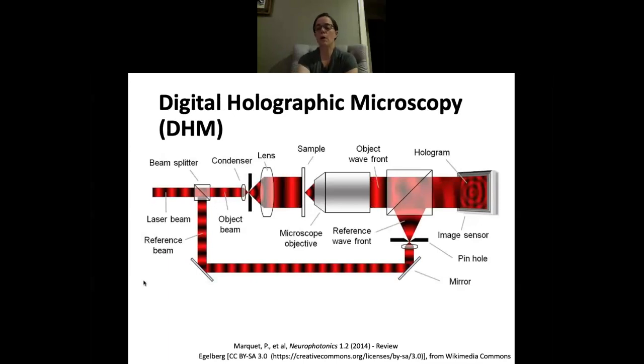Still, the most common and commercially developed quantitative phase imaging available for use in biology is the approach of digital holographic microscopy, sometimes combined with tomography. The digital holography approach enables live cell quantitative phase imaging using a single image capture rather than a acquired or computed image series.